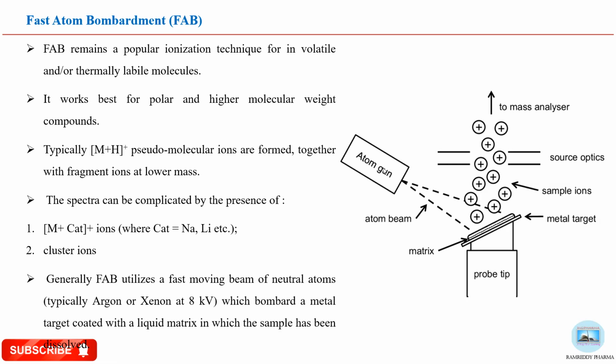From this gun, a beam of neutral atoms is bombarded onto your metal target. The metal target is coated with the liquid matrix in which our sample is present.